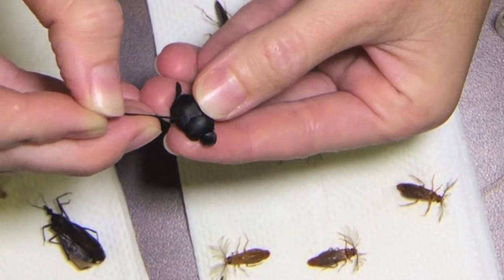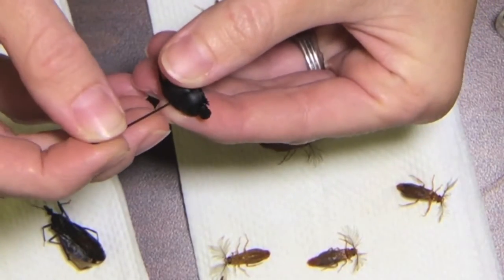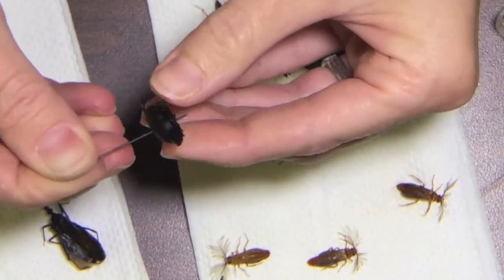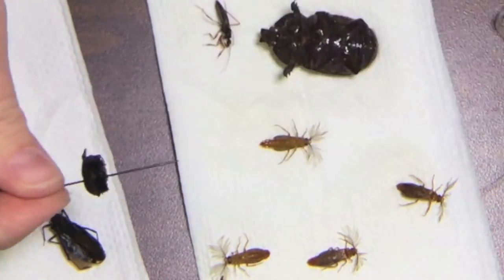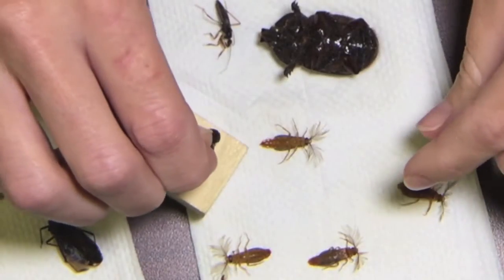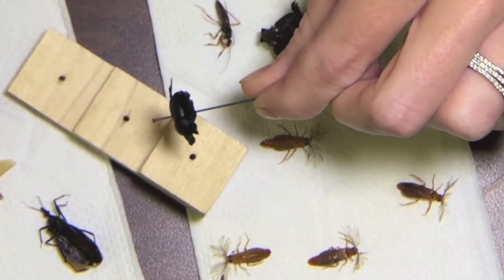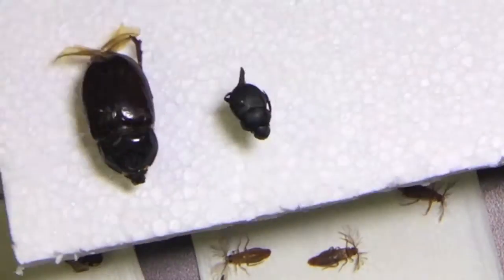This is a dung beetle, so I go into the wing just to the right of the midline. I see where the wings meet so I know where the midline is. Make sure that he's straight. Use my pinning block so that he's high enough up on the pin — about a pinky width, enough for me to grab and place him in my collection.